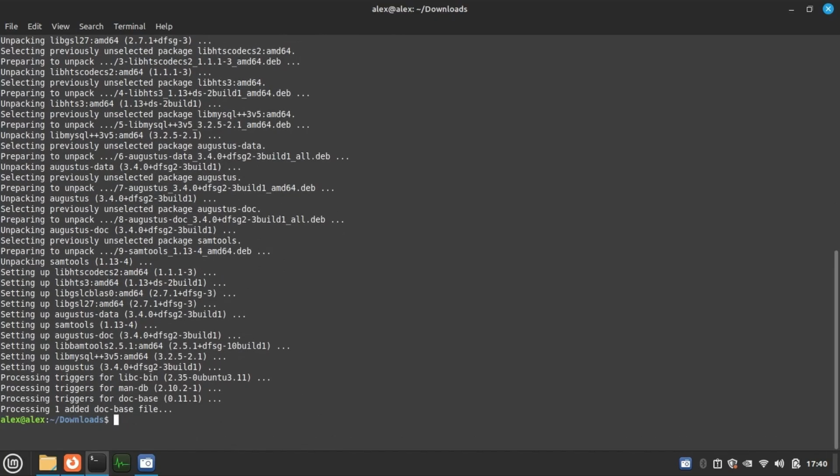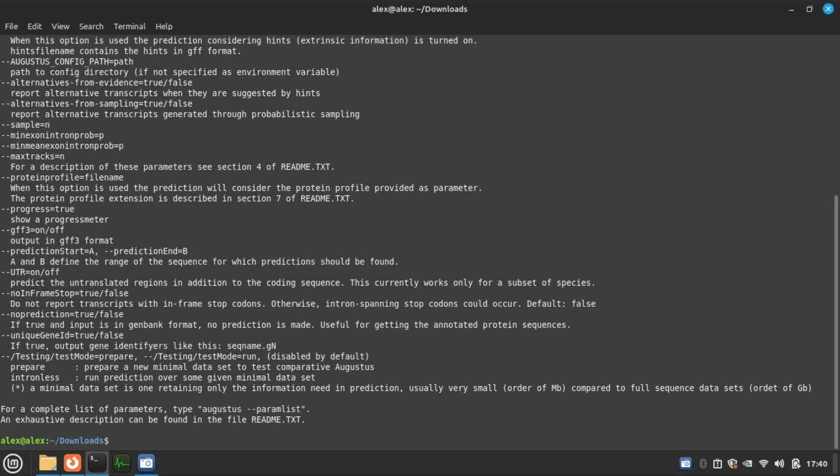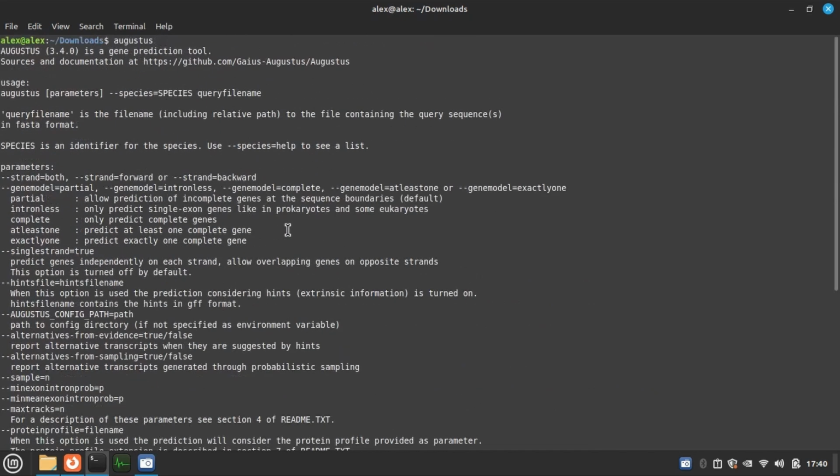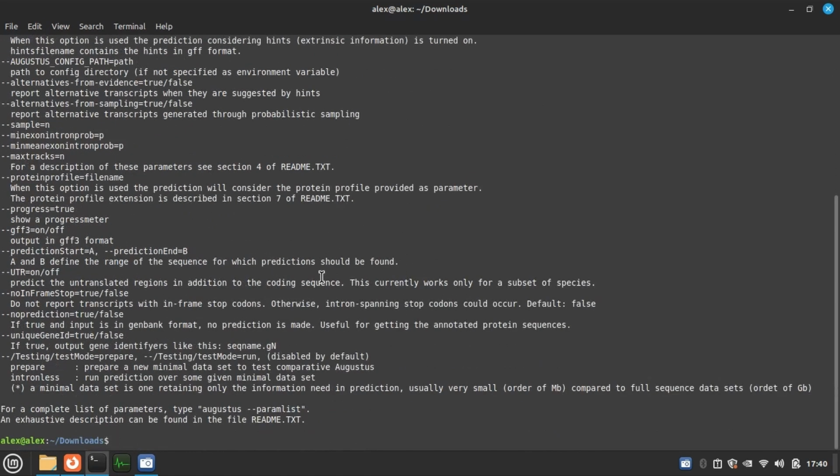So the installation is complete. Let's clear everything. Sorry, directly you can check Augustus. Just enter. So now you can see the whole usage of this Augustus tool. Let's clear it.